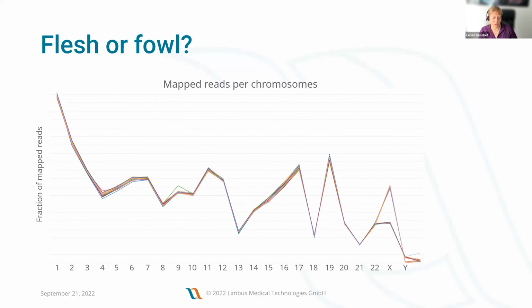And so this is one of my favorite plots. It's in the sequencing runs menu that Irene mentioned before, which is a menu where we show a lot of QC data and plots to help you evaluate the data, and also might sometimes give hints of what kind of problem the patient might have.